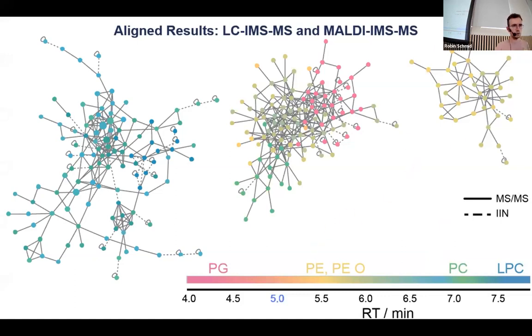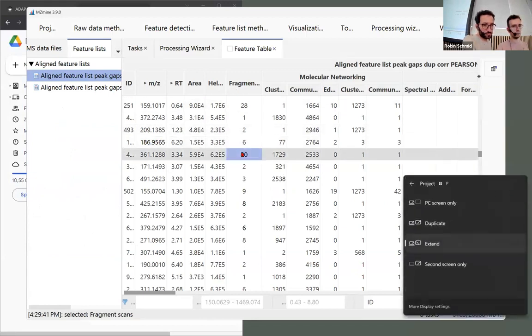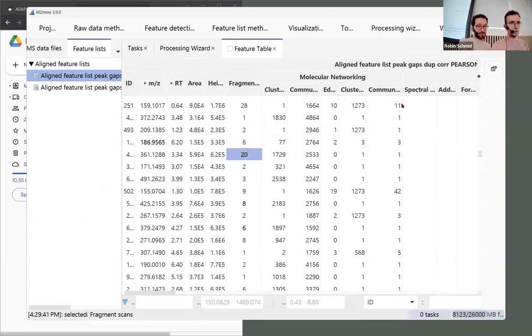now I need to exit. Yeah, and I need to share the correct screen again. Okay. I think it does that if you just cancel it. Yeah. Hope so. Can you see the correct screen, like the PowerPoint screen on the Zoom? Can you? I think you broke it. Okay, then I just reshare. So you should be able to see the MZmine now. Okay. Duplicate. And duplicate? okay, yeah.